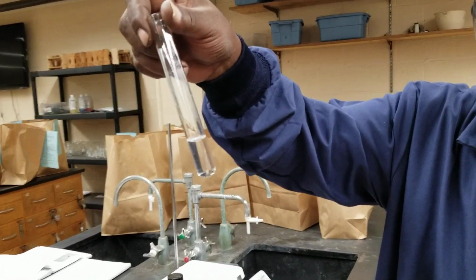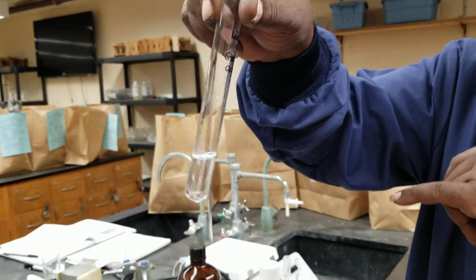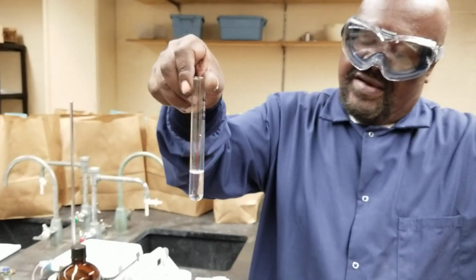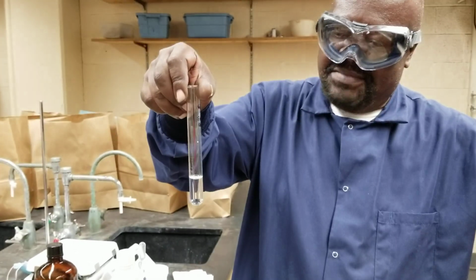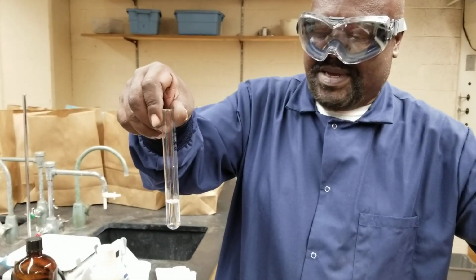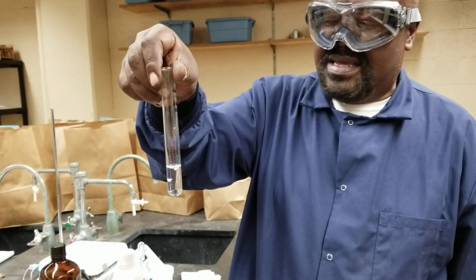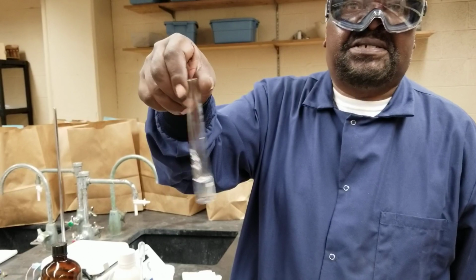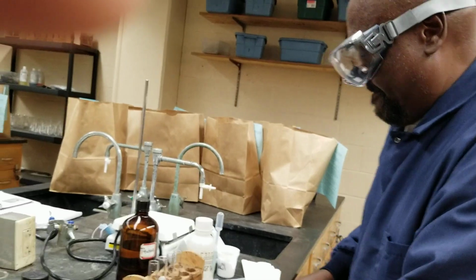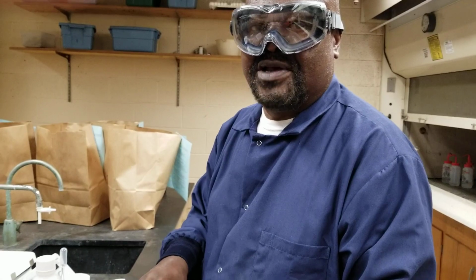So here's a challenge. The challenge is to describe whether it all got in. Certainly it didn't all get in because some of it is sitting at the top. So do we have solubility? Do we have partial solubility or total insolubility? Looking at the amounts there, I'm inclined to think most of what we put in is just sitting at the top. All right. We're done with solubility things. Moving on to the next section, my friends.